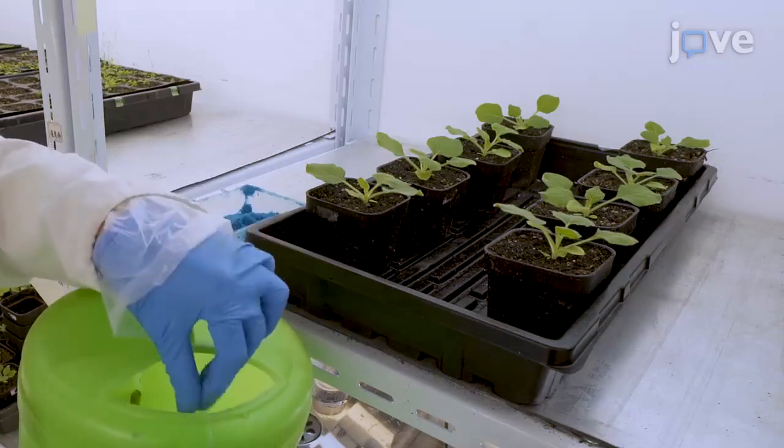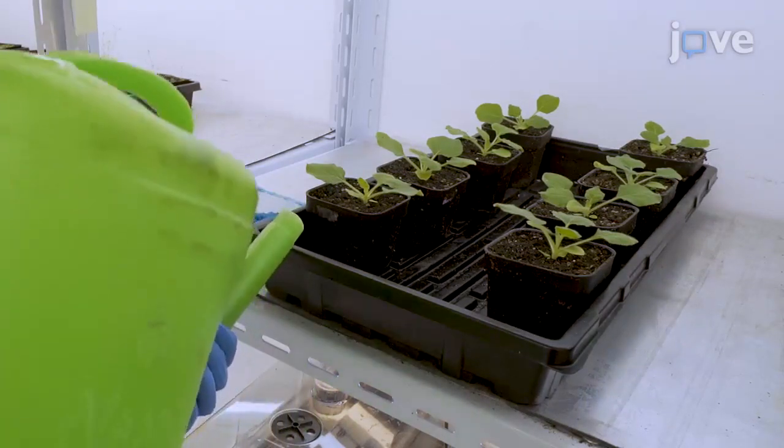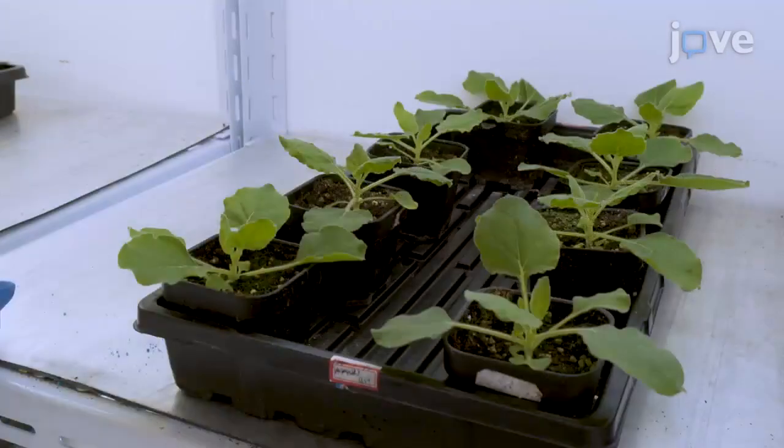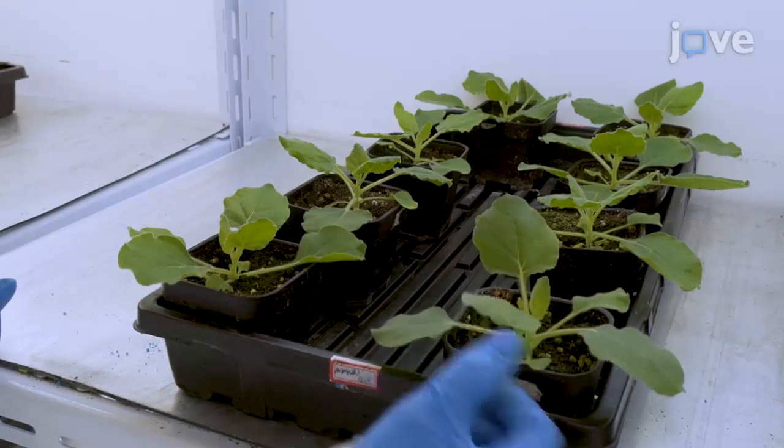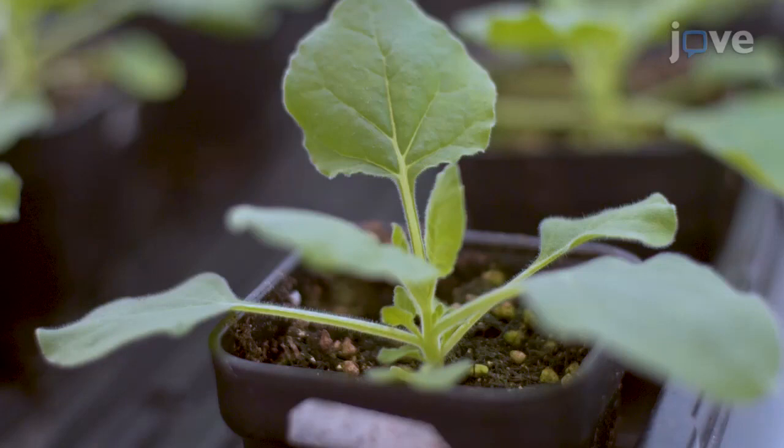Every ten days, add fertilizer to promote further growth. Maintain Nicotiana benthamiana 16c plants under normal conditions until the plants have at least five fully developed true leaves with no visible axillary or flower buds, and the leaves have a healthy green appearance.